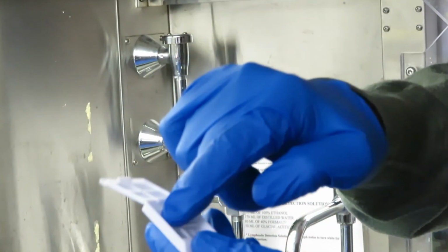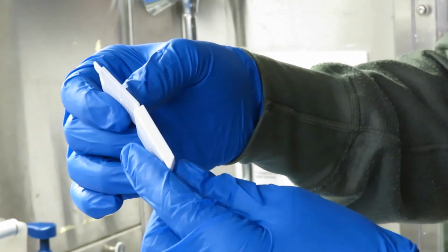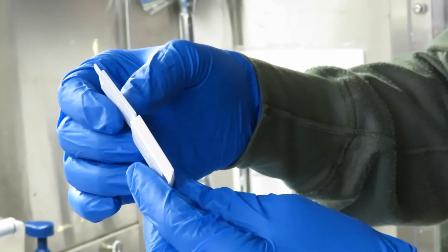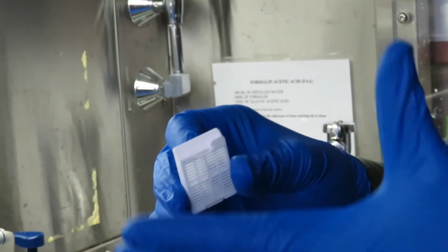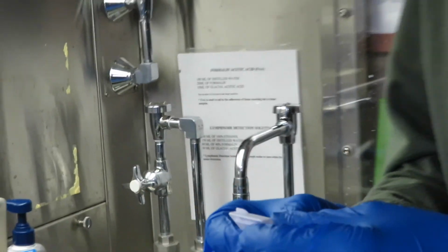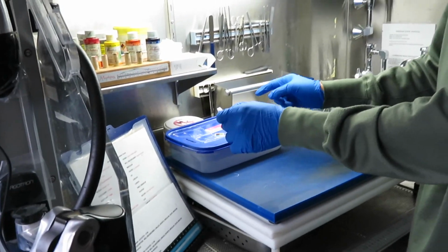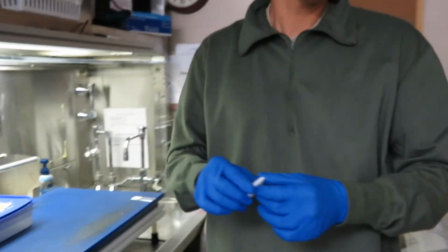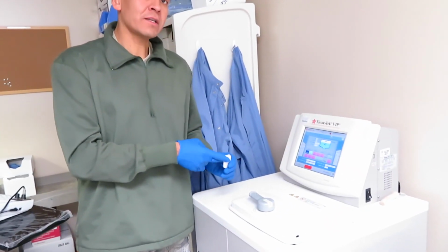So the tissue has to fit within there and be ideally less than a nickel thickness. Once we put it in there, we label it with the patient and the accession number. And what we do with these, we put it in a tray with all the other cassettes of tissue that we've grossed in, and then we bring it over here to the tissue processor.